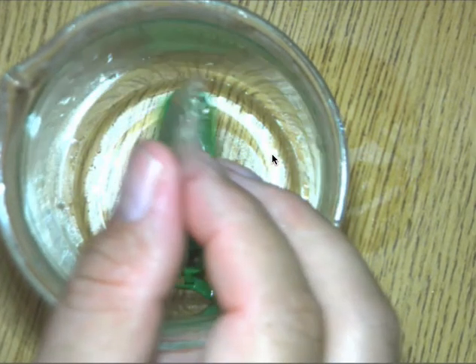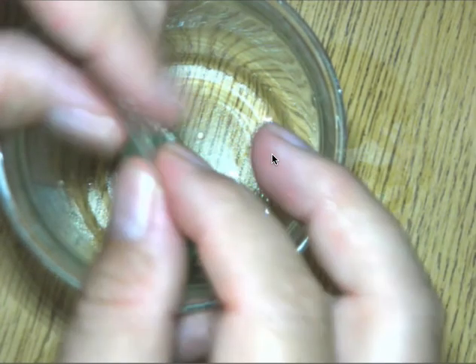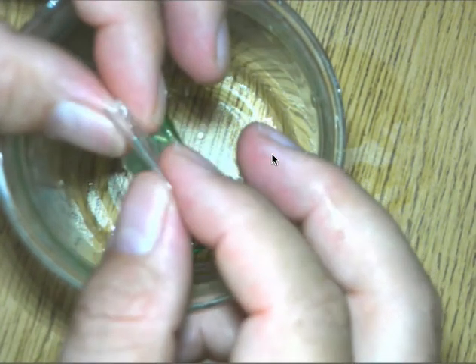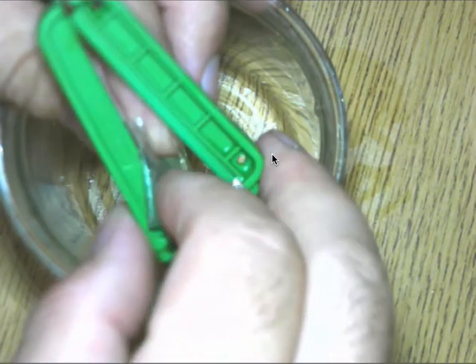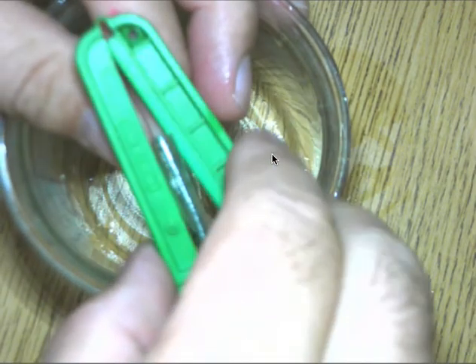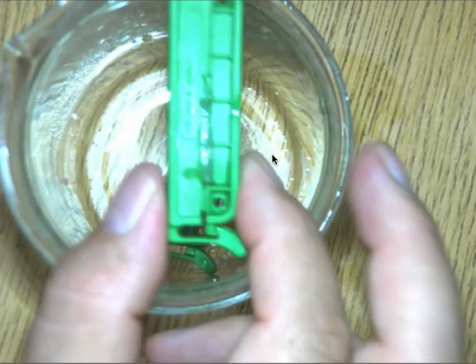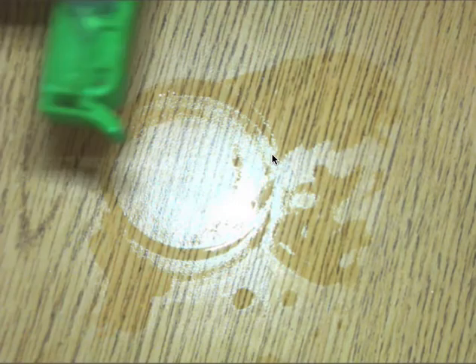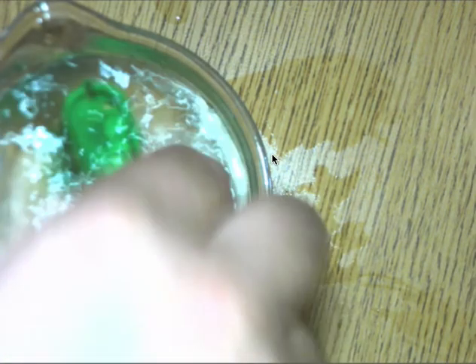Now it says fold down 1 centimeter. Take a clip. Clip it so that nothing can escape. Now use tap water to rinse. Now we're going to rinse this off by bringing in some tap water.